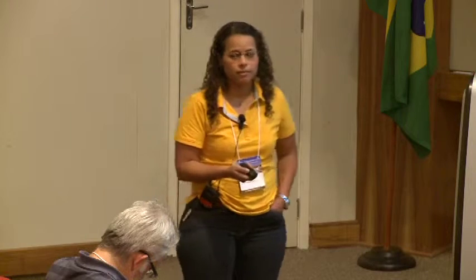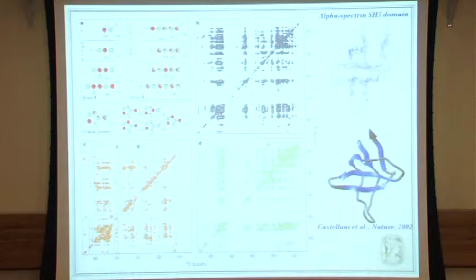This is quite interesting because you can observe the profile is completely different for each amino acid. So you can identify the amino acids much better in this spectrum. And if you are using 1,3-glycerol, you can also observe better here. You can have more peaks.